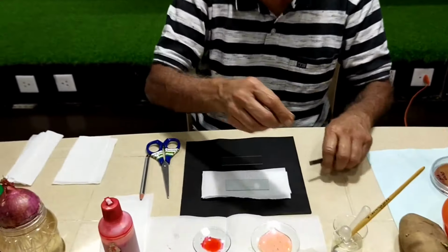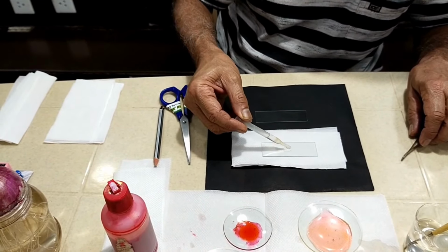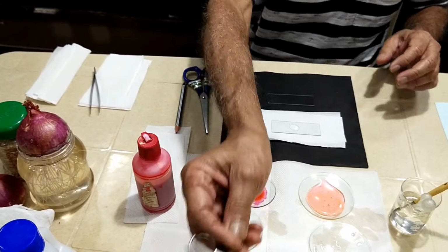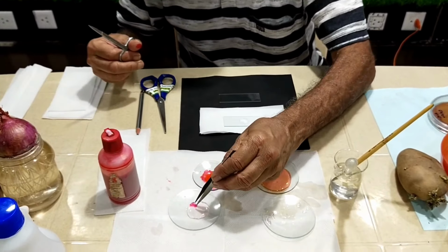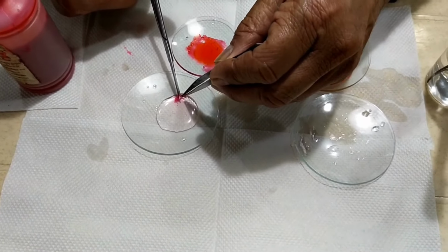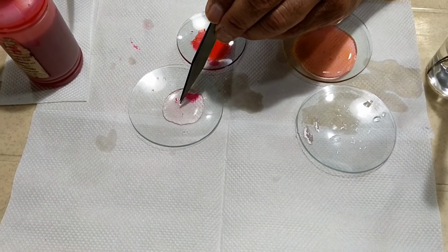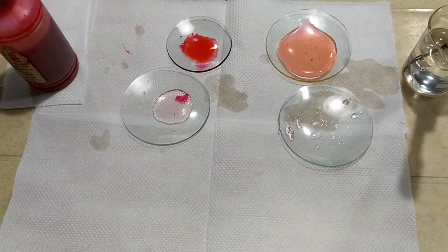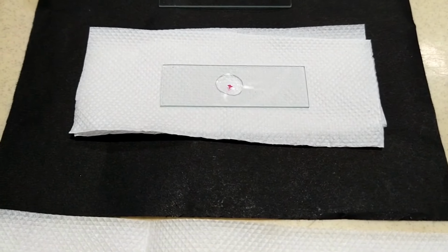Okay, now I'll take a tiny drop of water here, and I think I can use a better scissors. Yeah, I'll take this one. Then I'll pick up this piece of skin and cut it into pieces, and I require only a small, tiny piece. A tiny piece is good enough. In fact, I'm going to choose that one first. Can you see this tiny piece? It's quite good. You'll have many thousands of cells there.